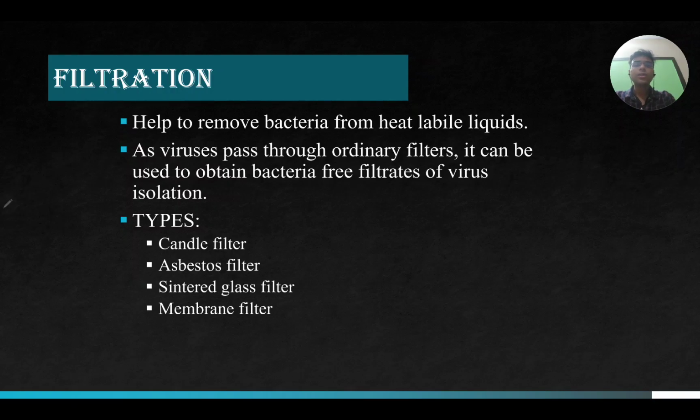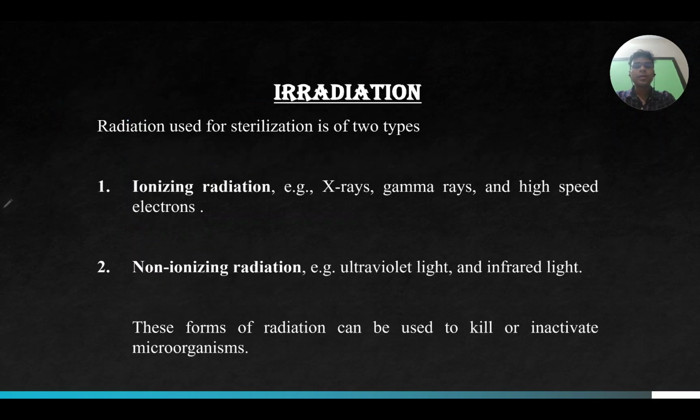Coming to filtration, it helps to remove bacteria from the heat labile liquids. As viruses pass through these ordinary filters, it can be used to obtain bacteria-free filtrates of virus isolation. The different types of filters are candle filter, asbestos filter, sintered glass filter, and membrane filter.